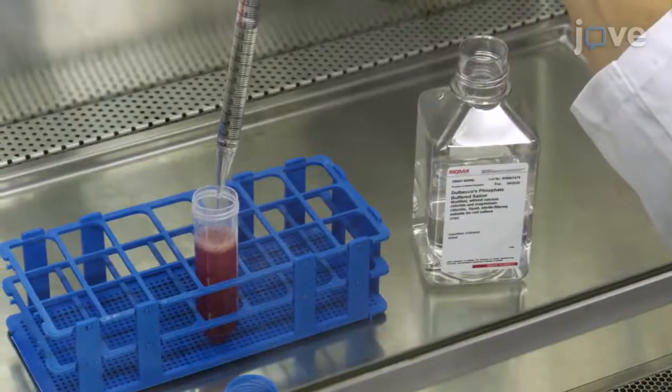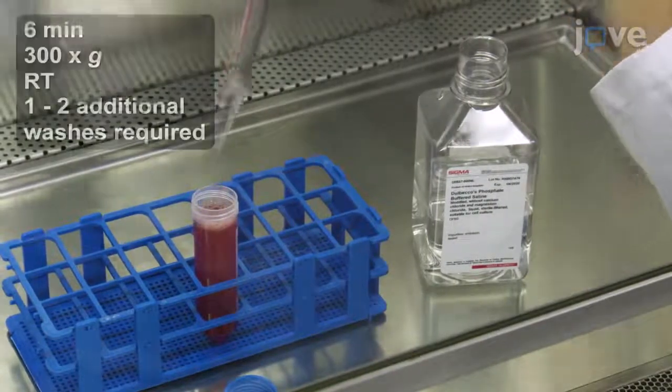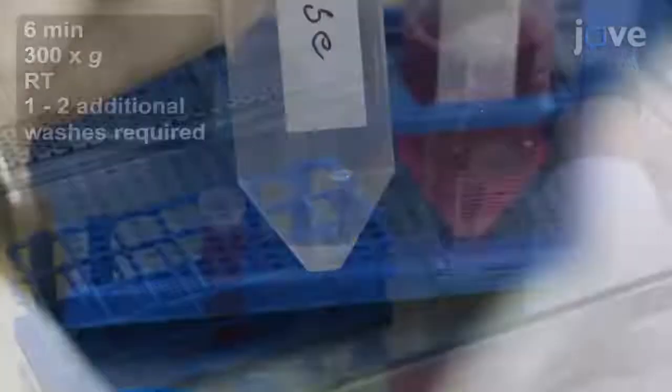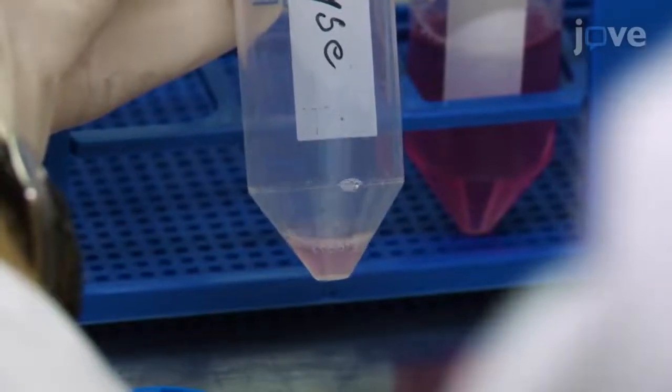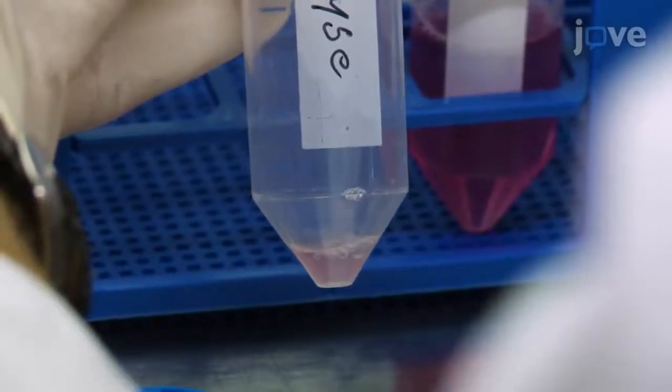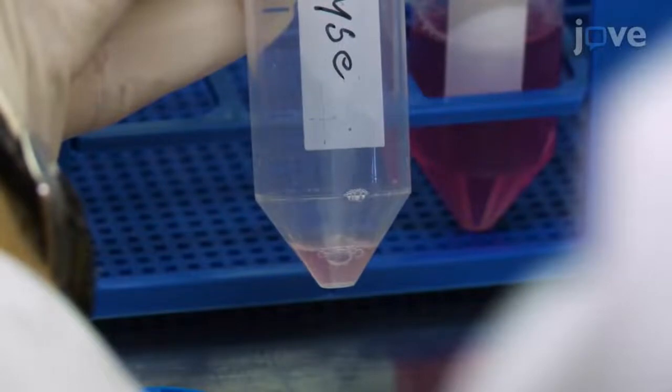After 8 minutes at room temperature, fill the tube with PBS for a centrifugation wash, and resuspend the pellet in 2 milliliters of culture medium for a 60-minute incubation at 37 degrees Celsius.